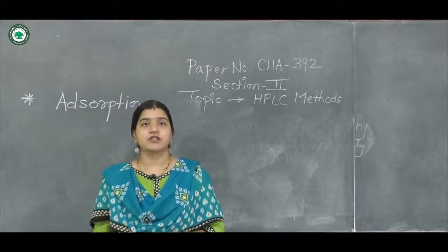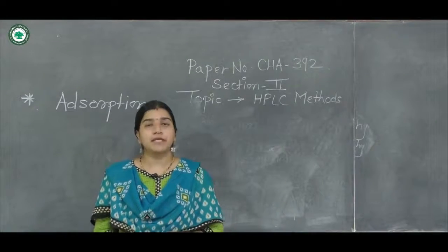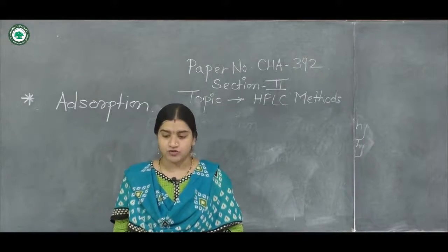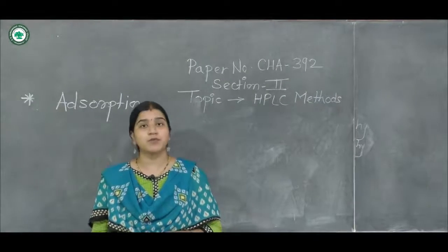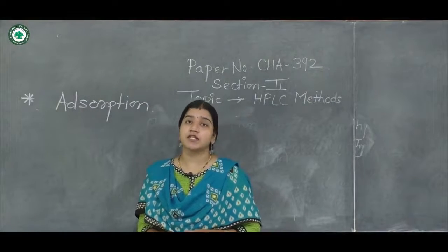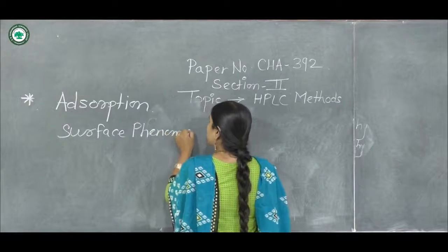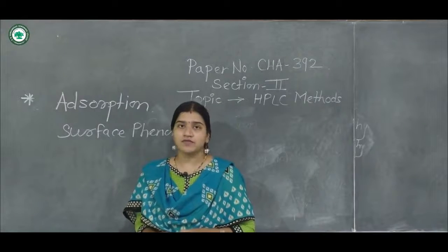To start the discussion, adsorption chromatography is based on the principle of adsorption. Here the separation of a mixture into different components is carried out by using the principle of adsorption. Before that, it is very necessary to understand the difference between absorption and adsorption. As all of you know, adsorption is a surface phenomenon, while absorption is not a surface phenomenon.